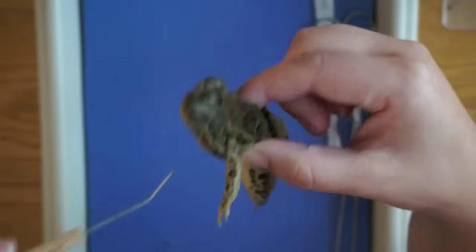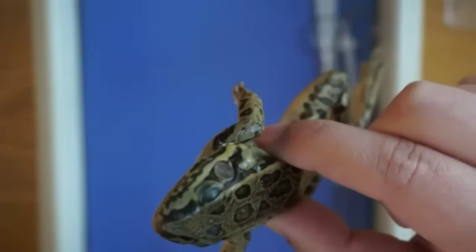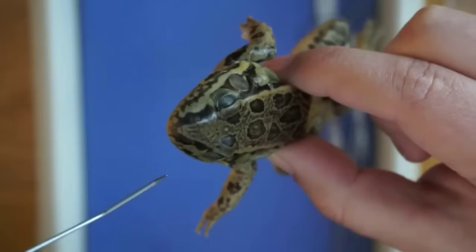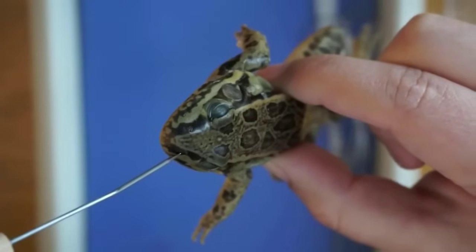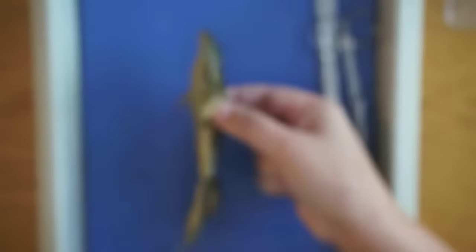You should certainly be learning about these as you read through your lab worksheet. And then on the nose of the frog — on the snout — you can see two external openings, and those are the nostrils.